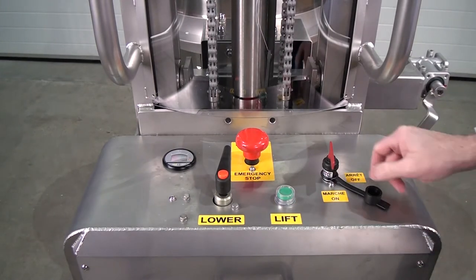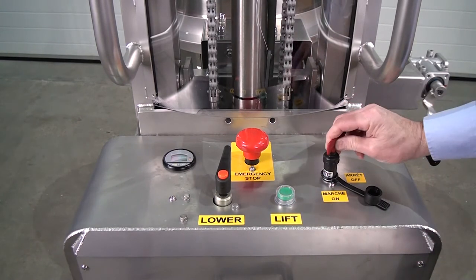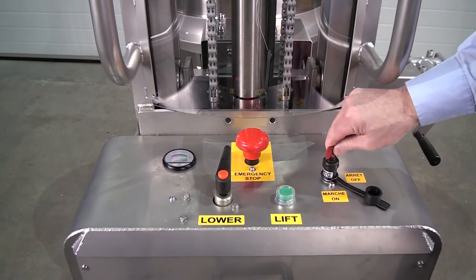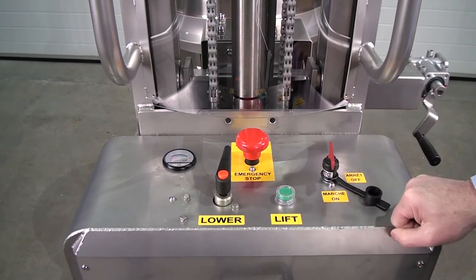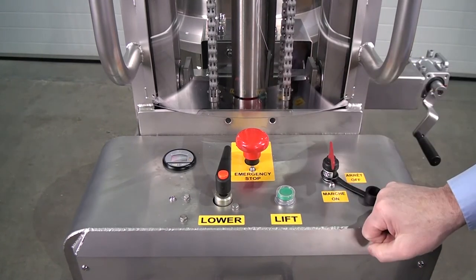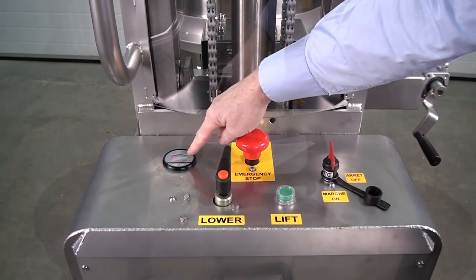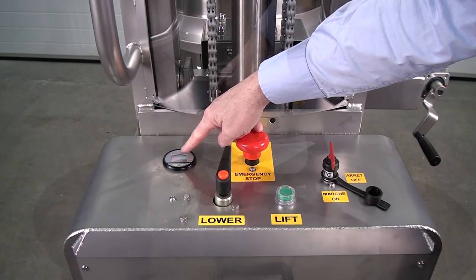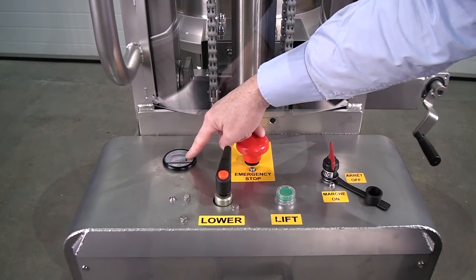We have an on/off key here, so you can turn this off and take the key out so you can't use the unit. Put the key in, turn — power on, E-stop armed. Then here is the battery condition meter, which tells you how much battery charge you have. Keep it charged up as much as you can.